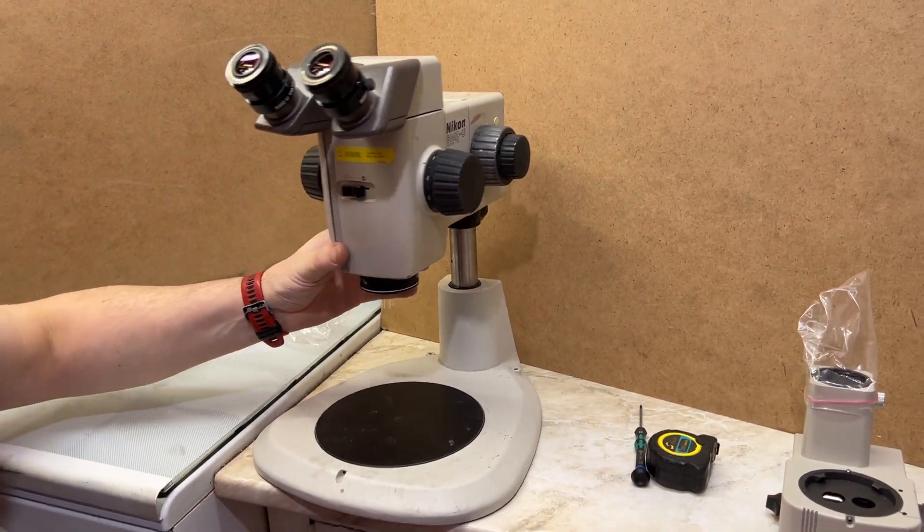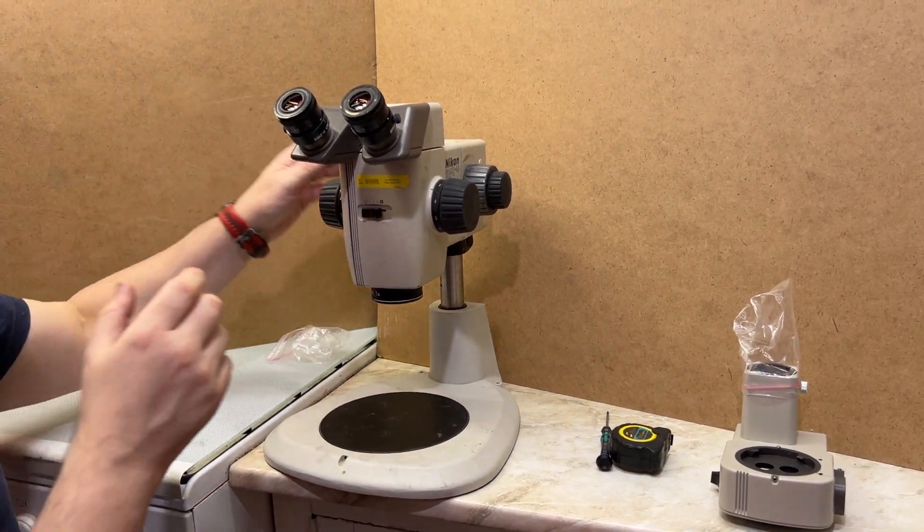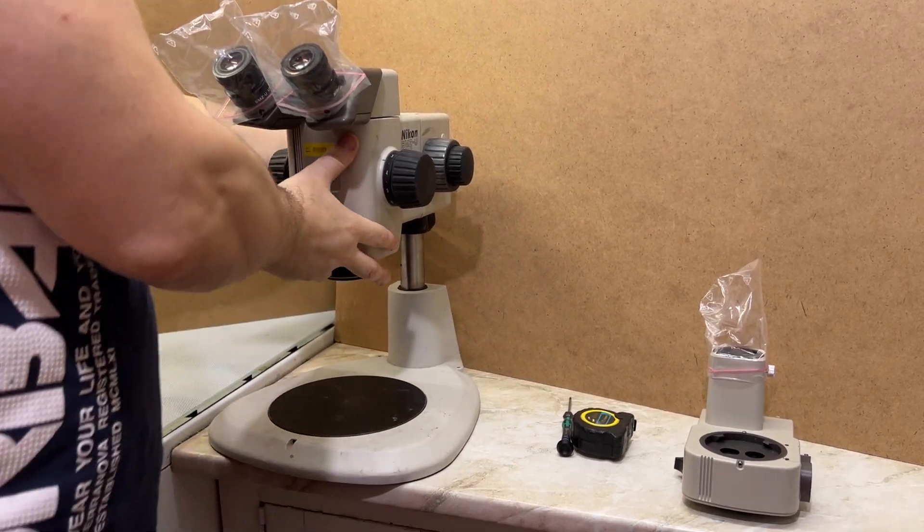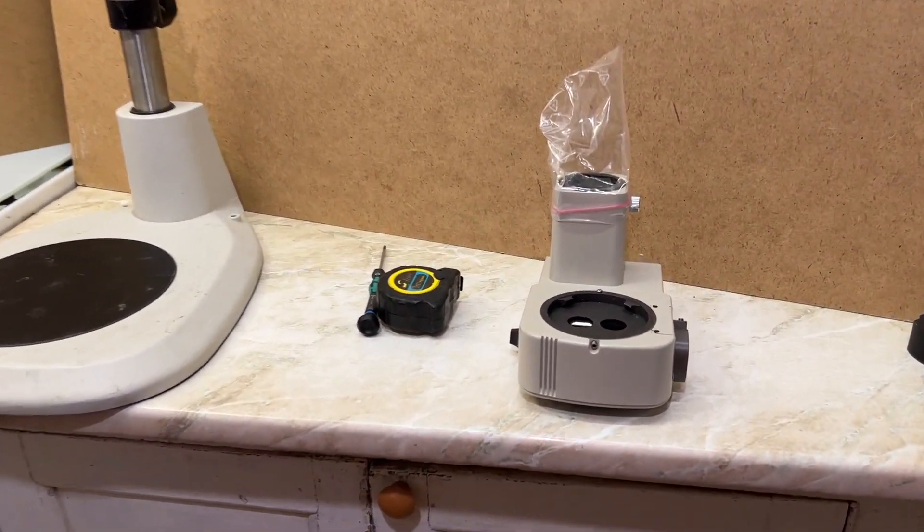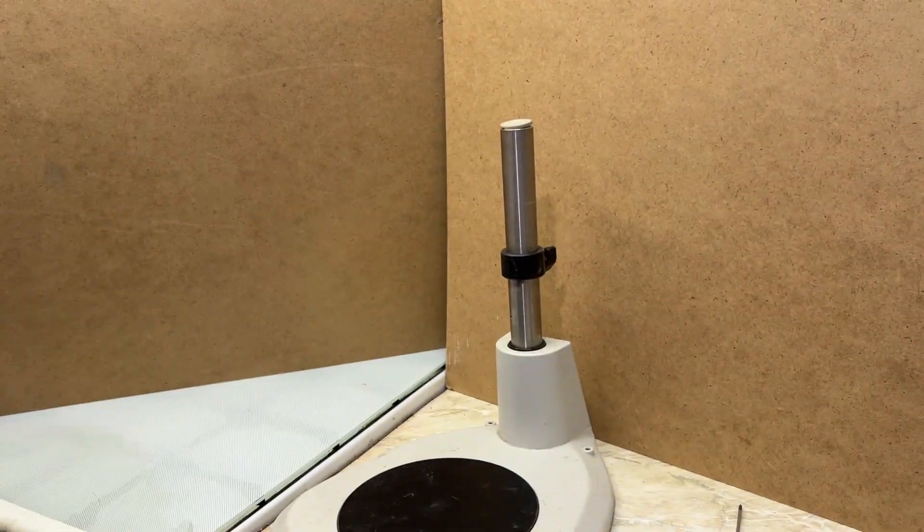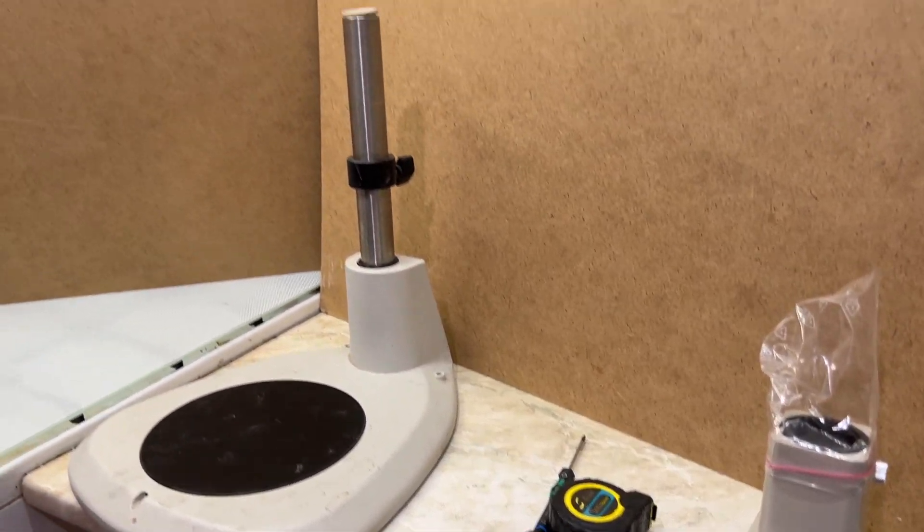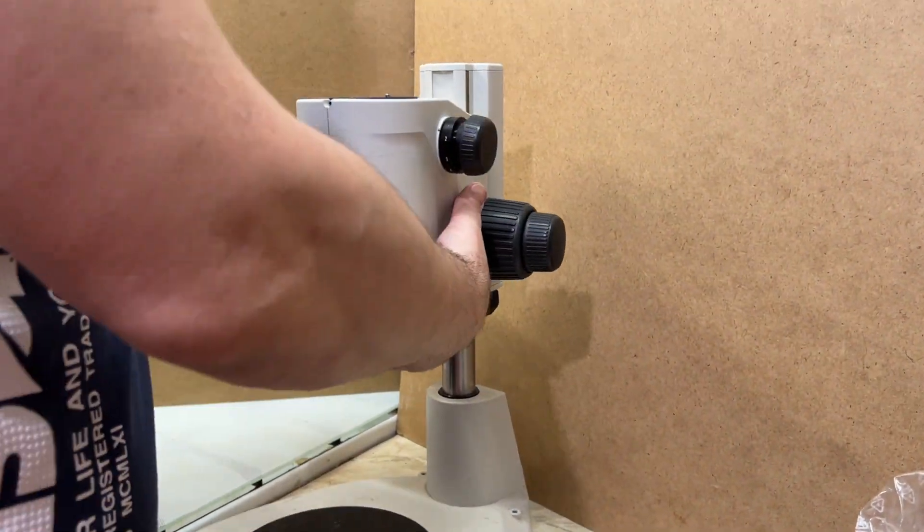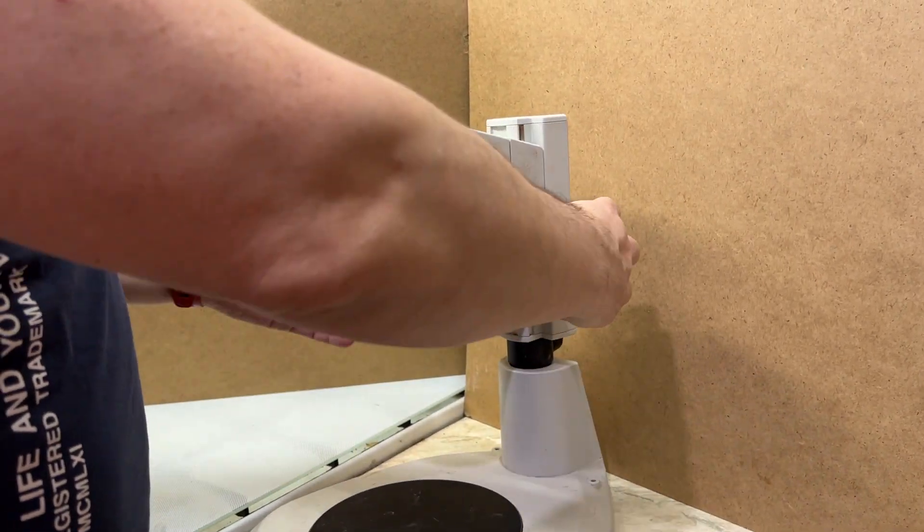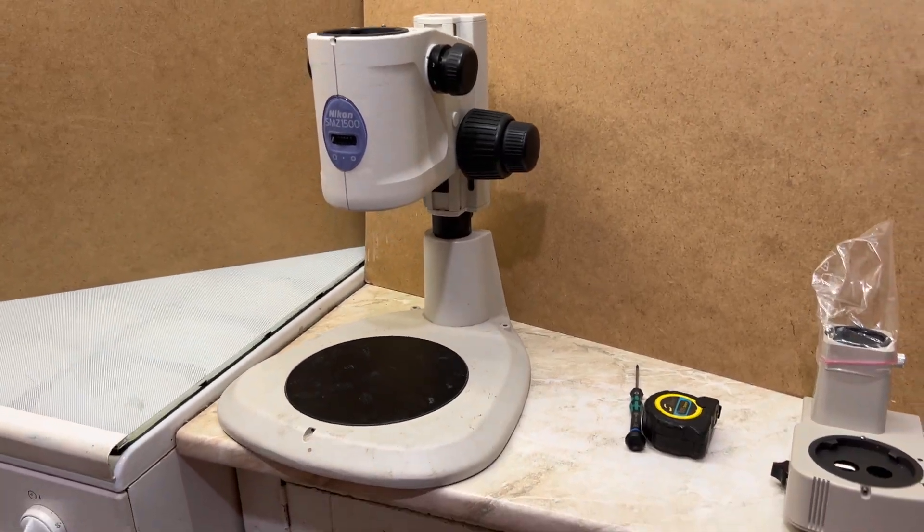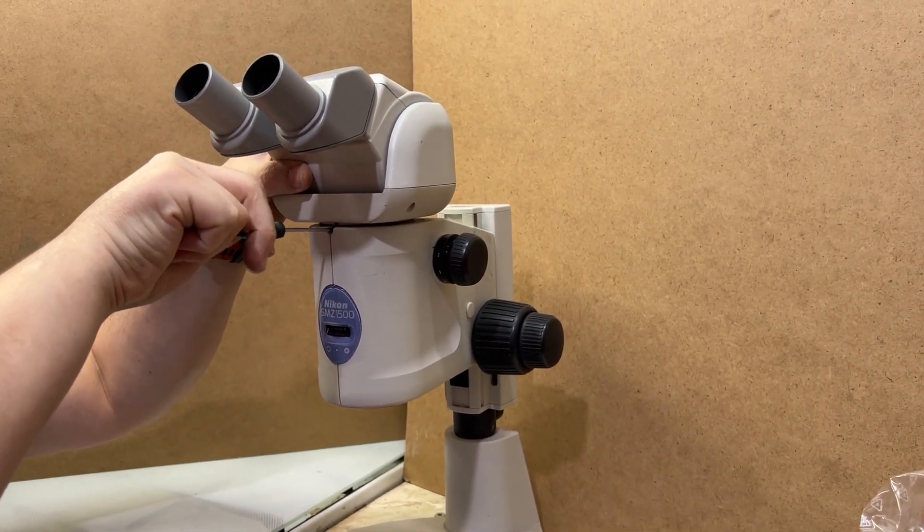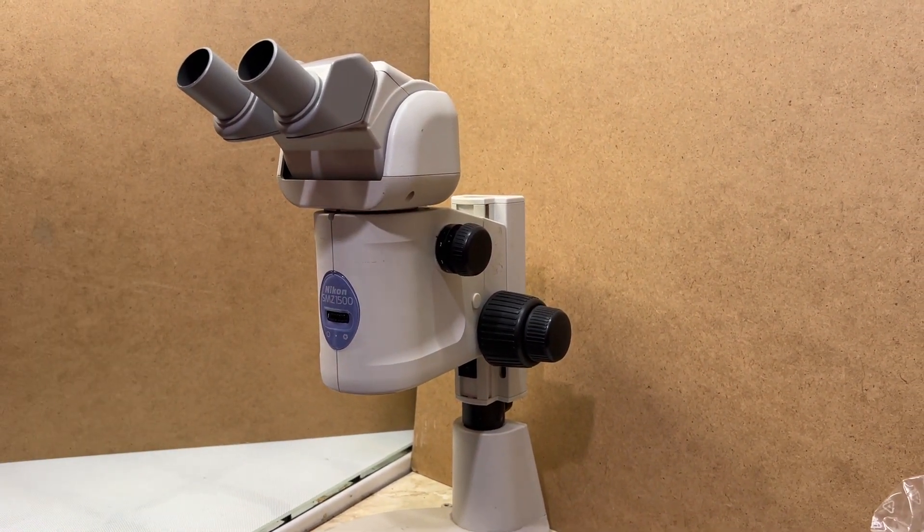We just have seen our stand. Let's see how this stand carries our Nikon SMZ1500 microscope, our top model. I'm taking the SMZ-U away. Our SMZ1500 has its own focuser with double speed tool. We need to attach our head here. I need to put the ergonomic head to the top of the 1500 microscope.